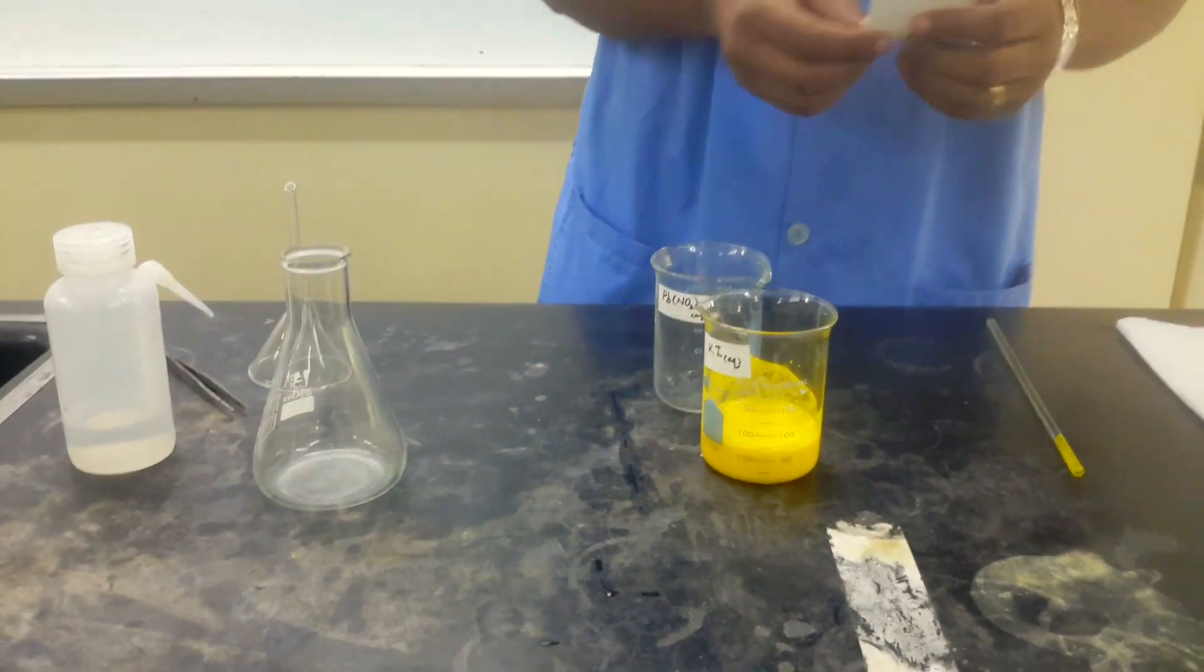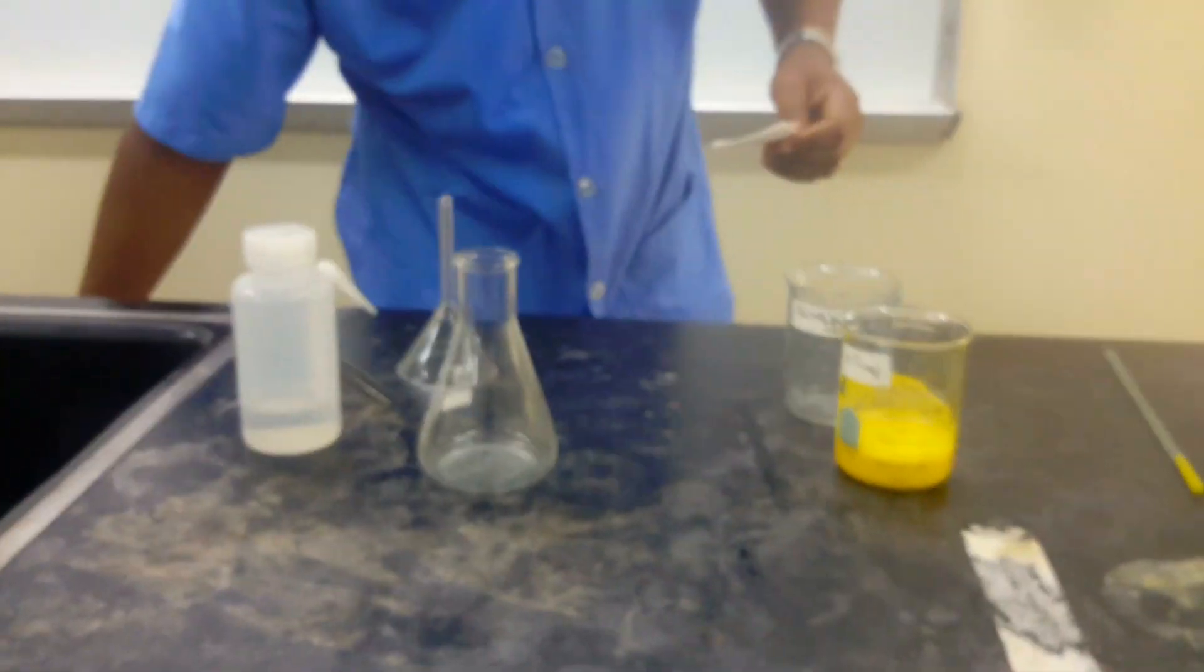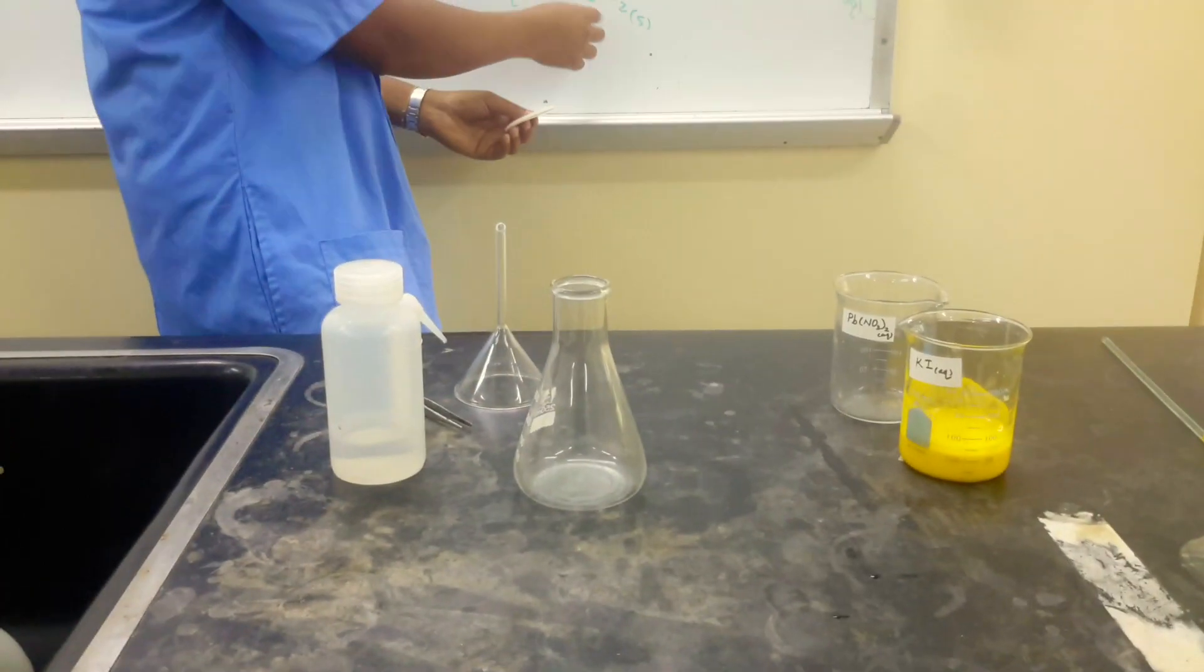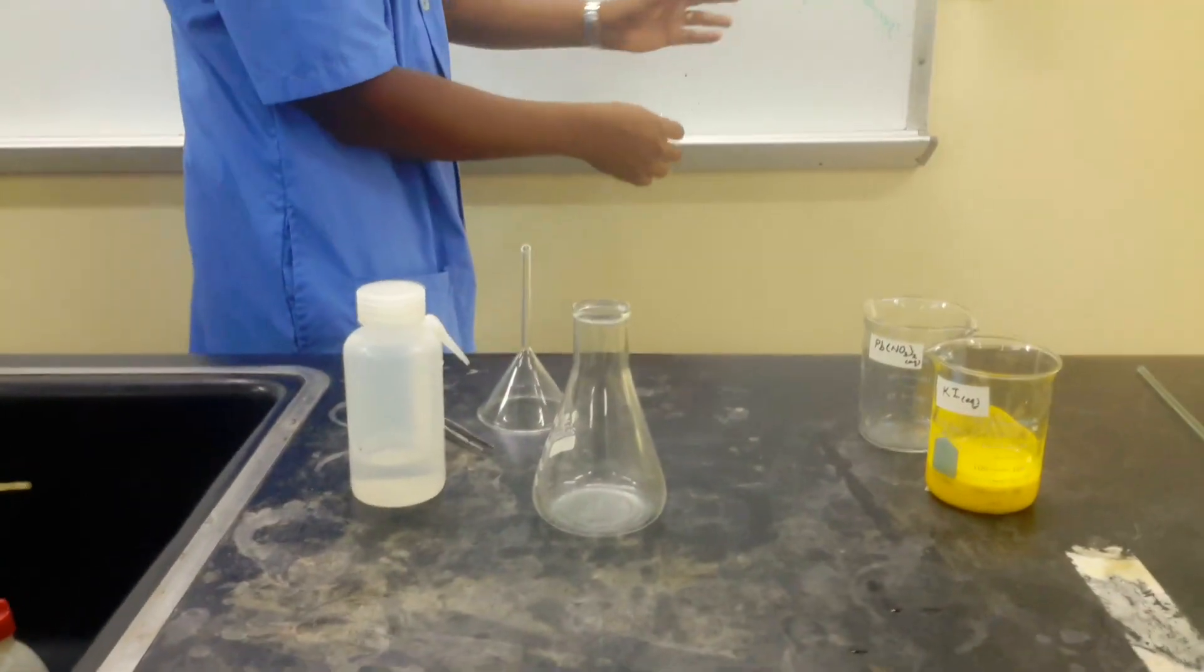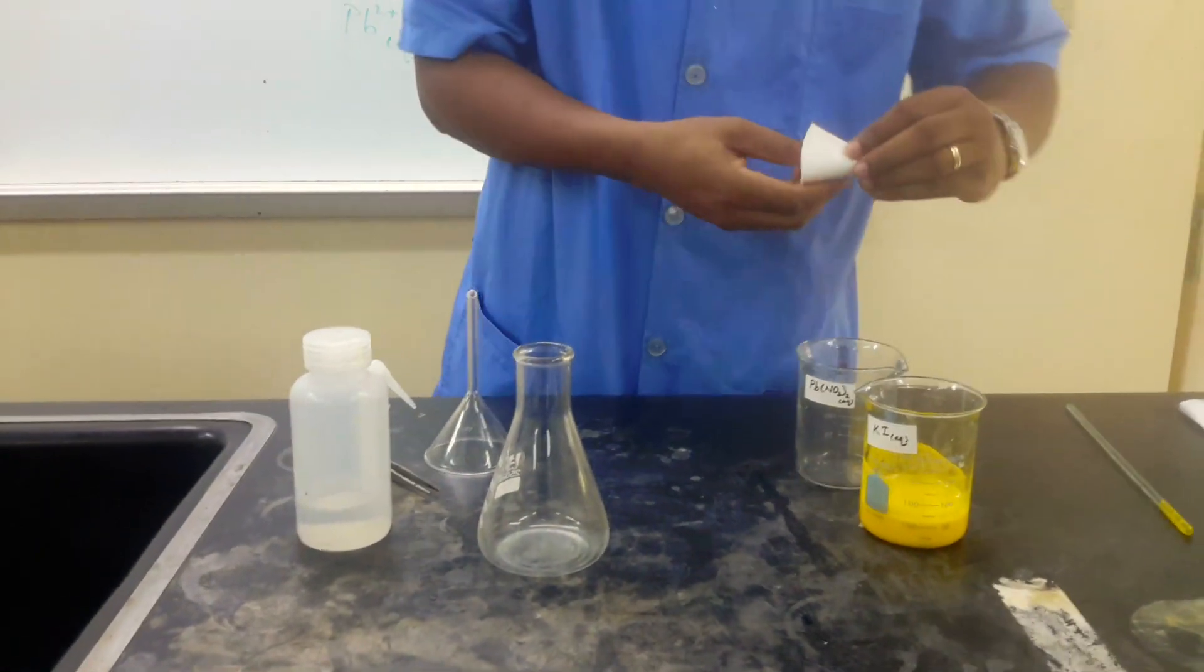So next we'll have to filter. So we'll get our solid, and the solid here would be our lead iodide. And the liquid that will be left would be our potassium nitrate, which we're going to have to filter.